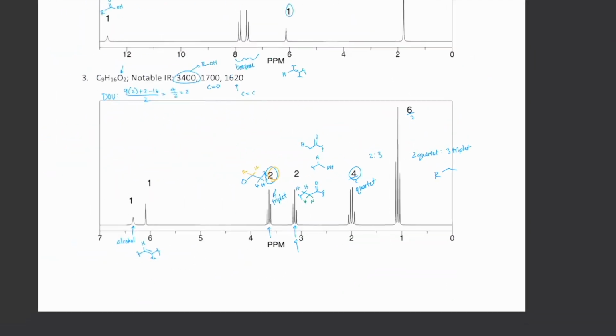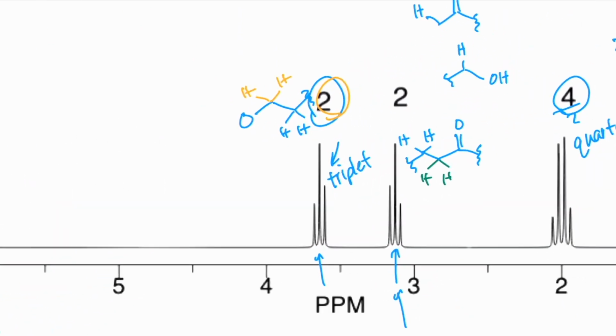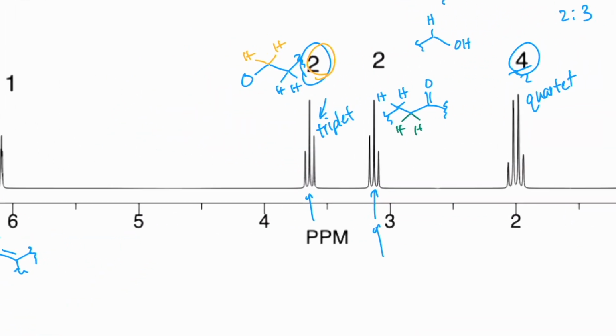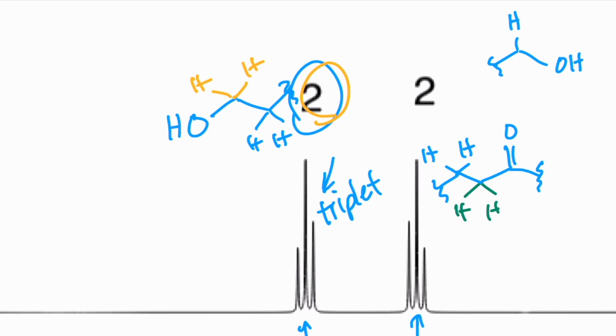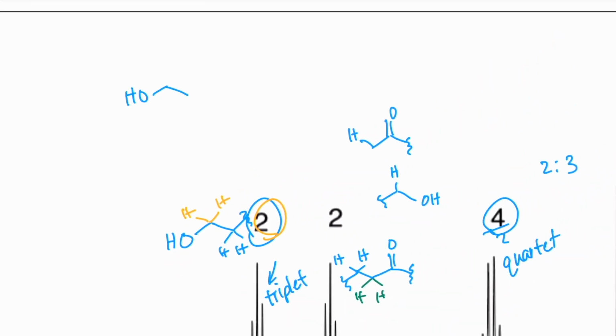All right, let's see. How are we going to put this all together? Well, here, if we take into account these 2, here's our 2 oxygens. And we know we have an alcohol, so that means this guy is not an ether, it's an alcohol. And we see this same exact pattern, right? Those line up. So likely we have HH, HH. We have our carbonyl here, and now we got to figure out the rest.